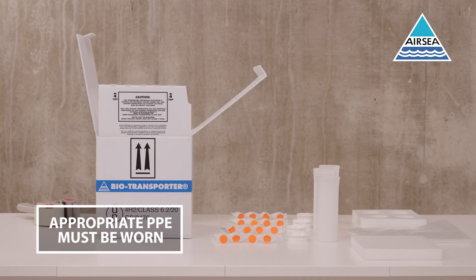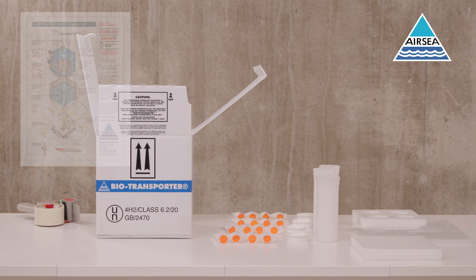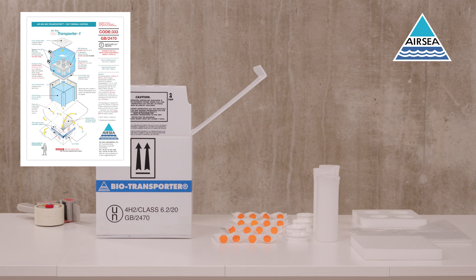Category A infectious substances require triple packaging. This consists of leak-proof primary receptacles, leak-proof secondary packaging, absorbent material, cushioning, and a rigid outer. Always refer to the assembly instruction for Code 333 when assembling this packaging.